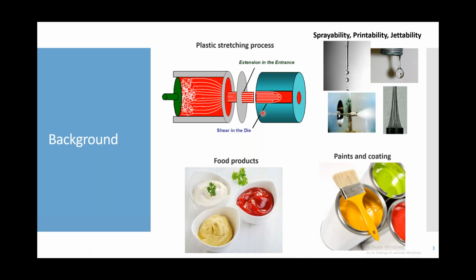I'm going to start off my presentation giving you some quick background about the importance of extensional viscosity in industrial applications. So you will learn about the practical aspects of extensional viscosity measurements, the nature of the experiments we have done, and you will understand why they are informative and important. Extensional or elongational viscosity is a fundamental parameter in many industrial processes. Here I'm going to show you some of these processes.